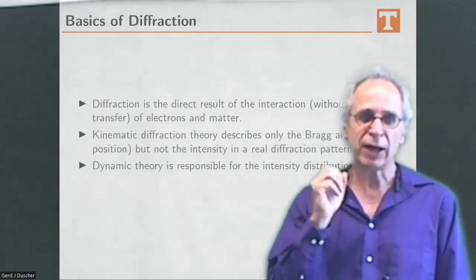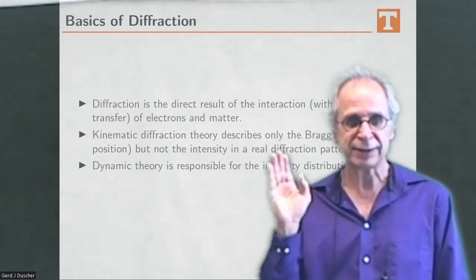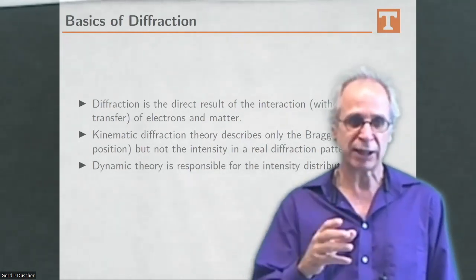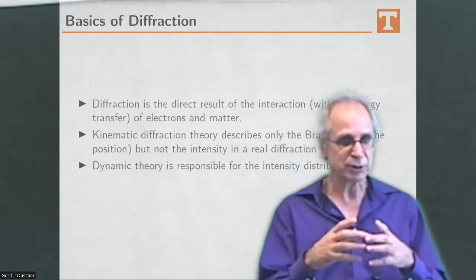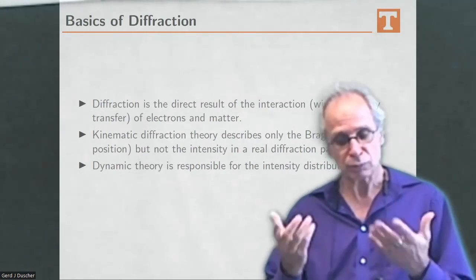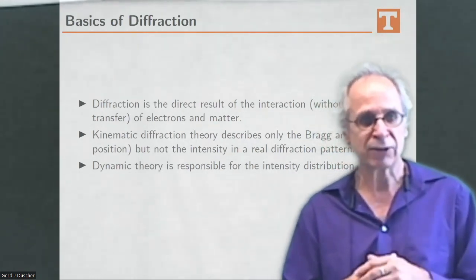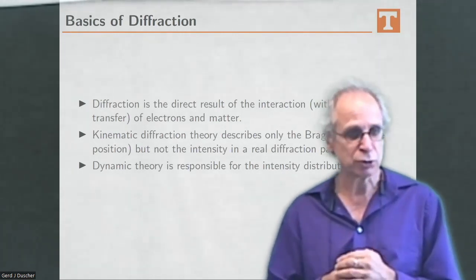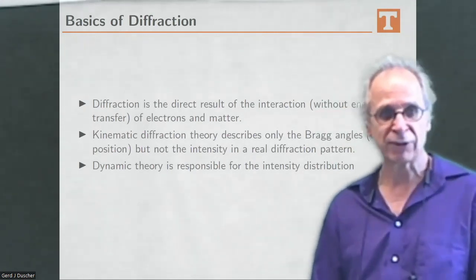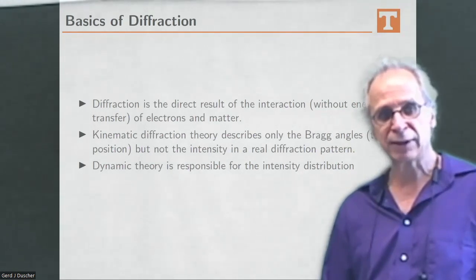So if we have a diffraction pattern and we don't care about what kind of intensity these Bragg peaks have, or in STEM images with the convergence angles, the disks, the pattern in the disk, then we can just use all the normal kinematic scattering theories that we're used to in X-ray diffraction. And of course, we use all these methods synergetically so that we get an answer.